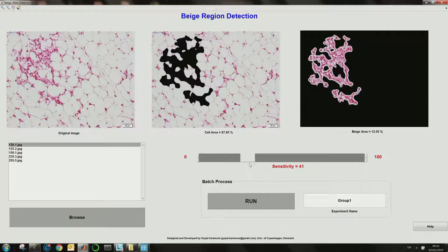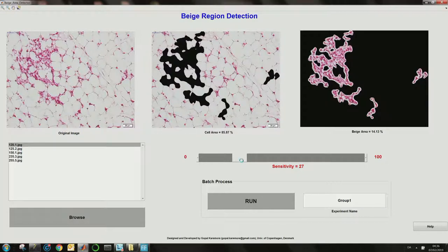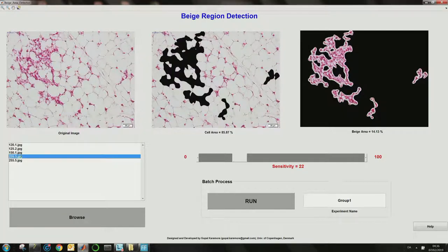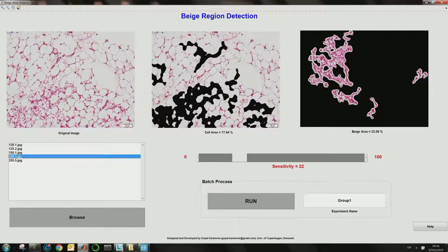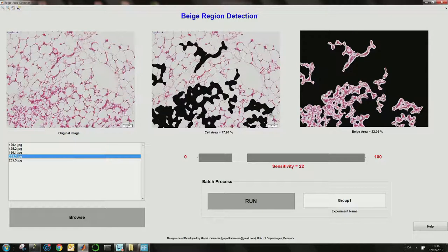In my case I'm happy with around 22. If I want to see how well the sensitivity generalizes to the rest of the images, I just have to double-click any of the images to see the output for sensitivity 22 of that image. Now I'm happy with this 22 sensitivity threshold.